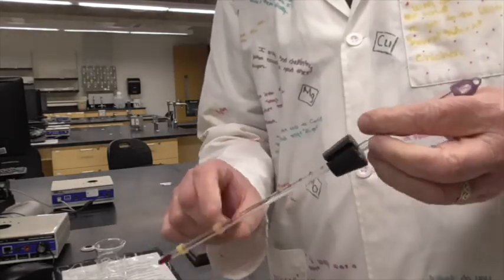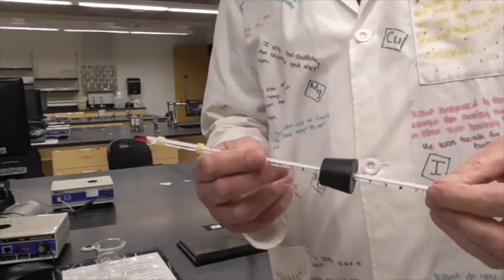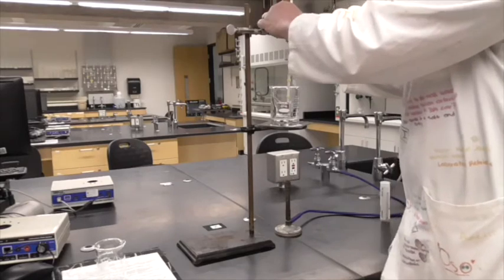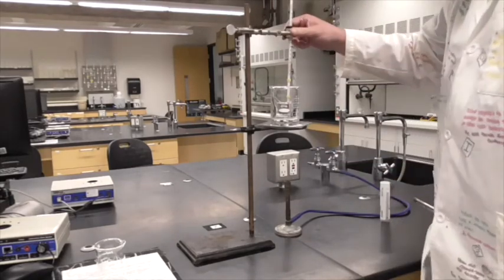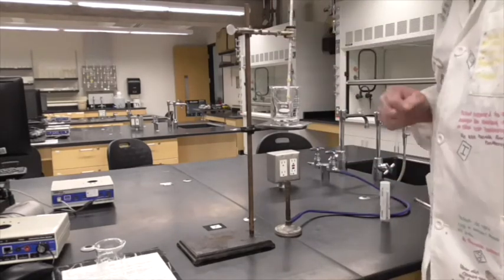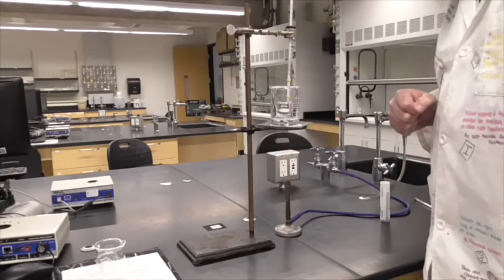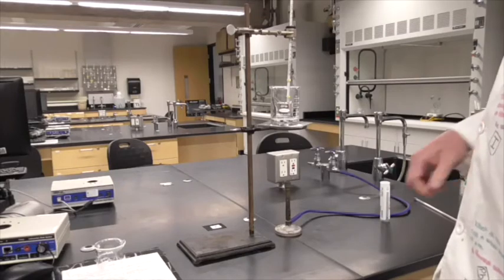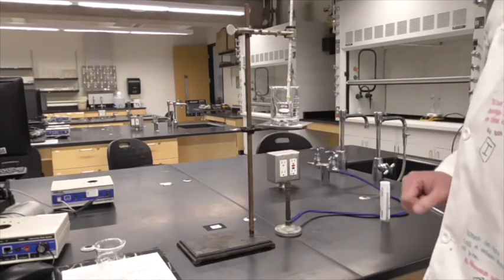Okay, so we've got that, and then we've got a clamp up top here that will hold the thermometer in our water bath. Okay, so let's move on to the freezing point of paradichlorobenzene.